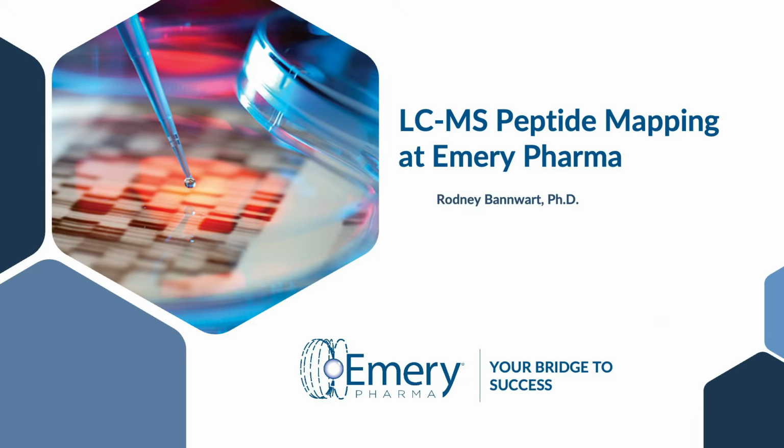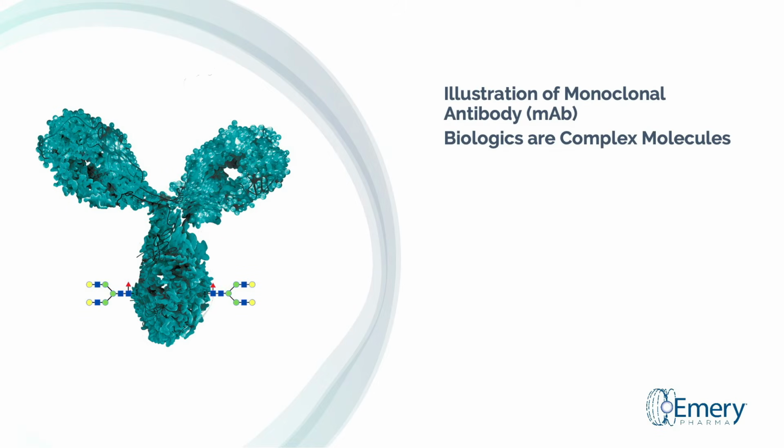Prior to Emery, I was at Alcon and Novartis for 10 years, where we studied biologics molecules by LC-MS. These molecules included antibodies, antibody fragments, and therapeutic proteins. Before that, I studied isolation and identification of small molecules at Pfizer in La Jolla. I have approximately 20 years total experience on LC-MS analysis working with instruments such as QTOFs and Orbitraps. I have worked on biologic compounds from early development stage all the way through to commercialization.